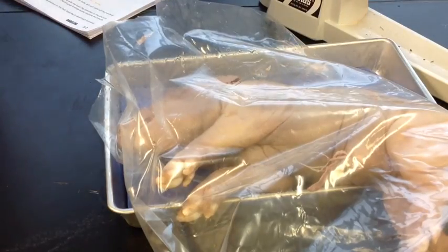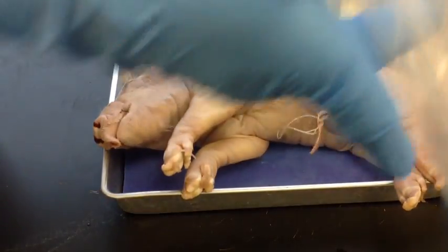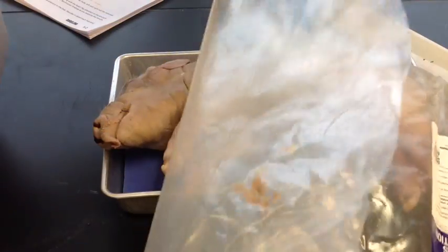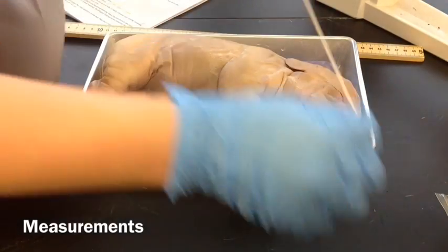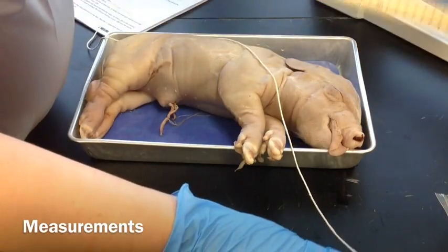We're going to save the juices until later. Then we're going to measure the length of our pig. We're going to use a string and a meter stick to do that.